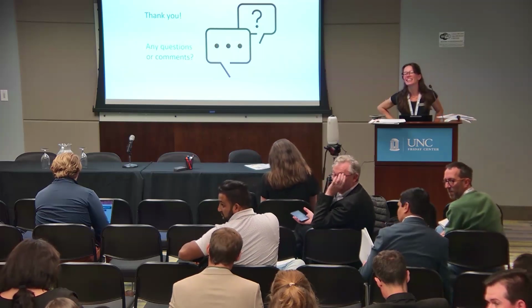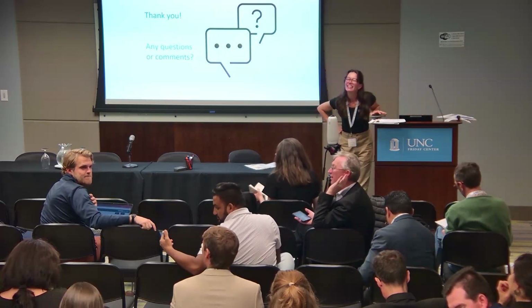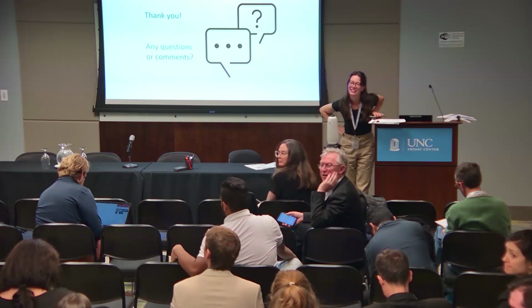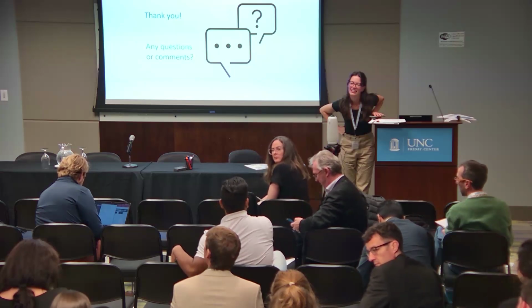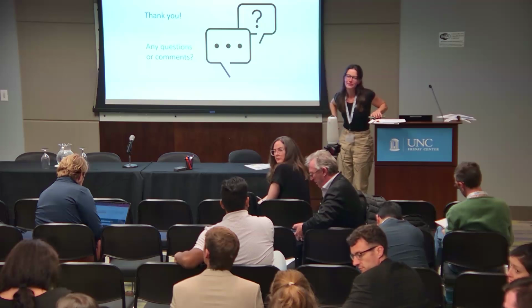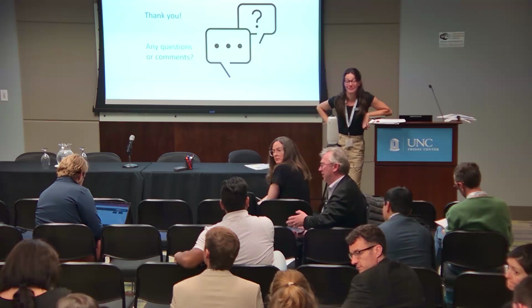Hi, I'm Sabina from UNICEF. When you said the criteria for measuring the microbial tests, are you also considering the baseline characteristics of the water? In my experience in Nepal, we used dry compact plates.